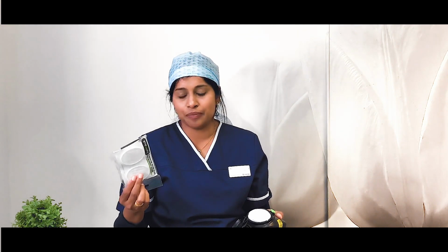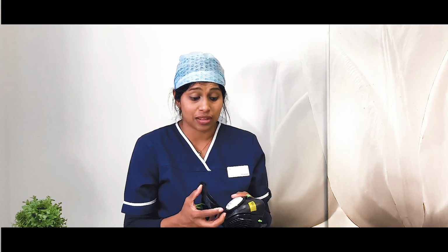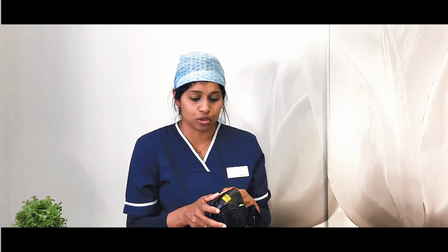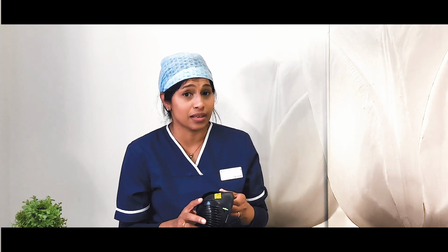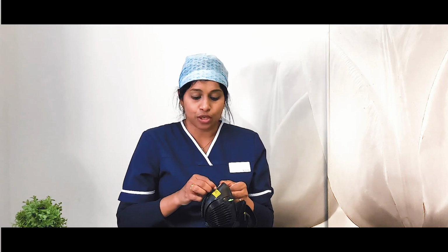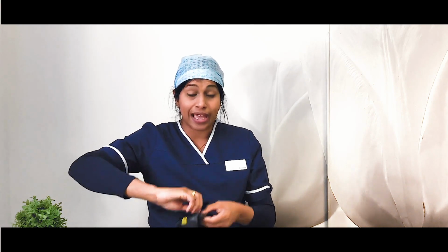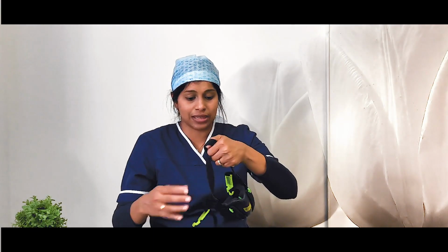They say once in 24 hours or once in 1 week. But again, those are for when there is a lot of dust and that sort of area. In dentistry, I think we probably should be okay for it to go up to 28 days, is what I understood from all my readings, because otherwise it works out to be very expensive. So these filters for the Stealth, and they are quite comfortable. I can wear my loops with this, so that is the best thing that I found.